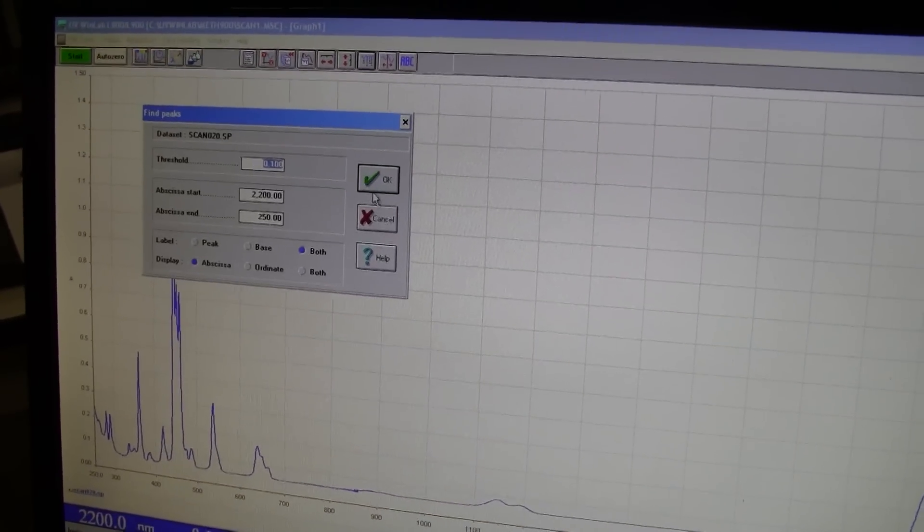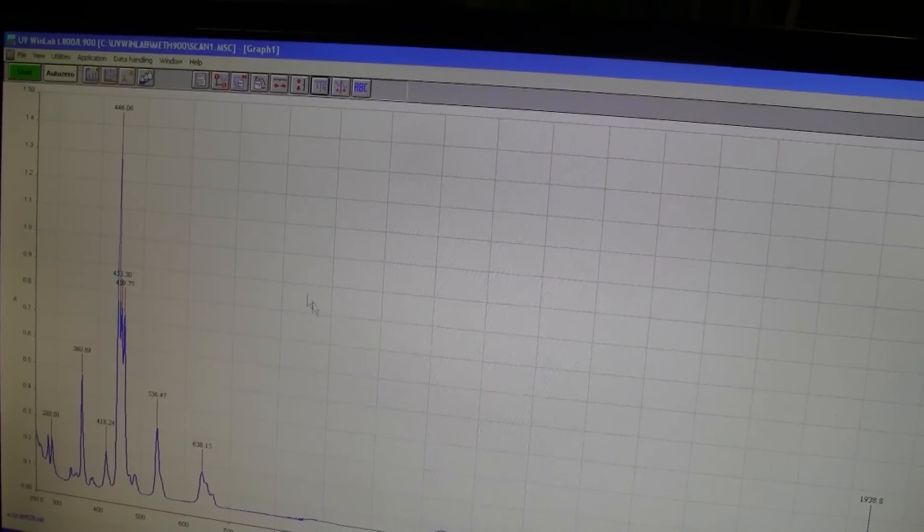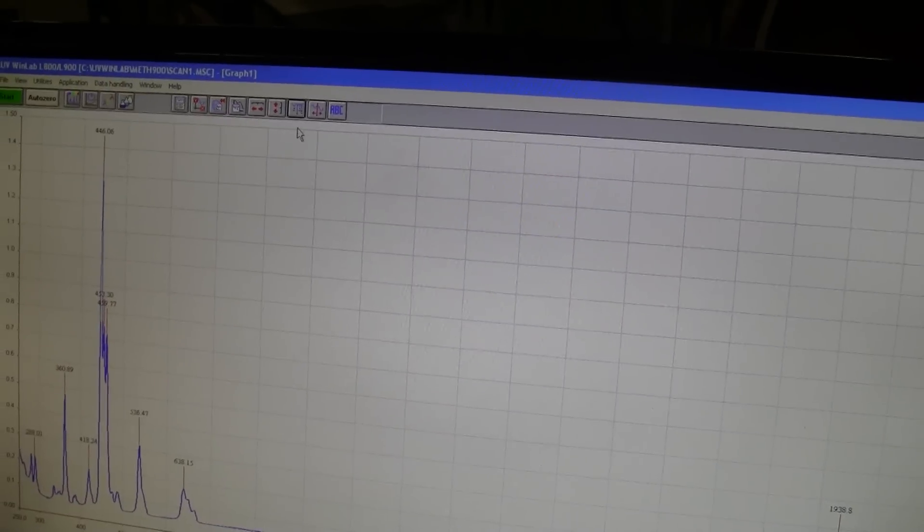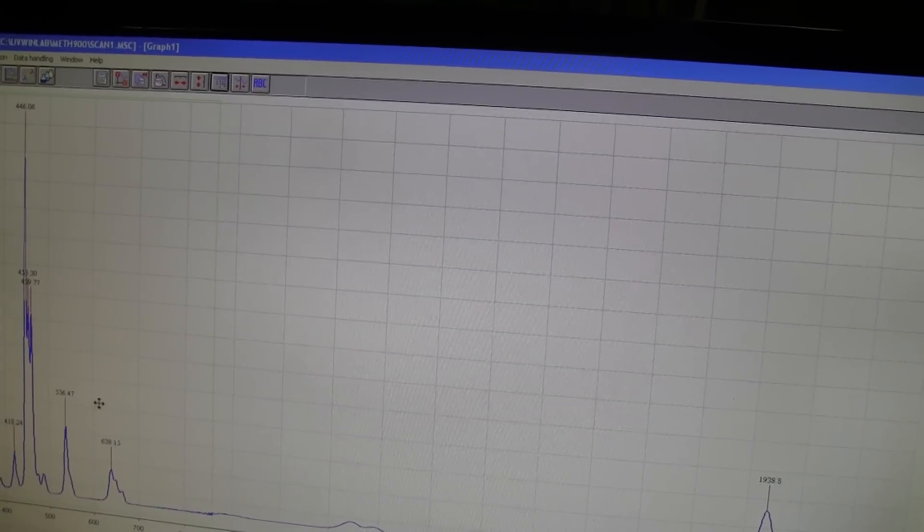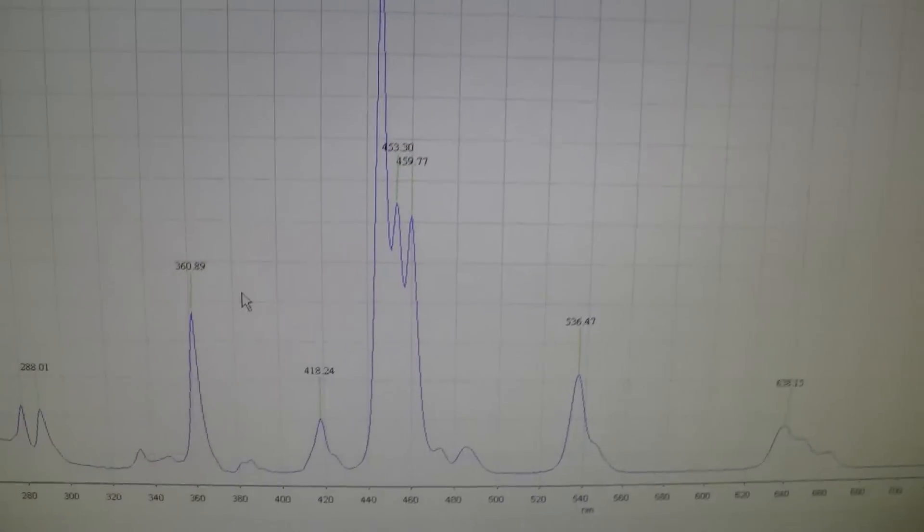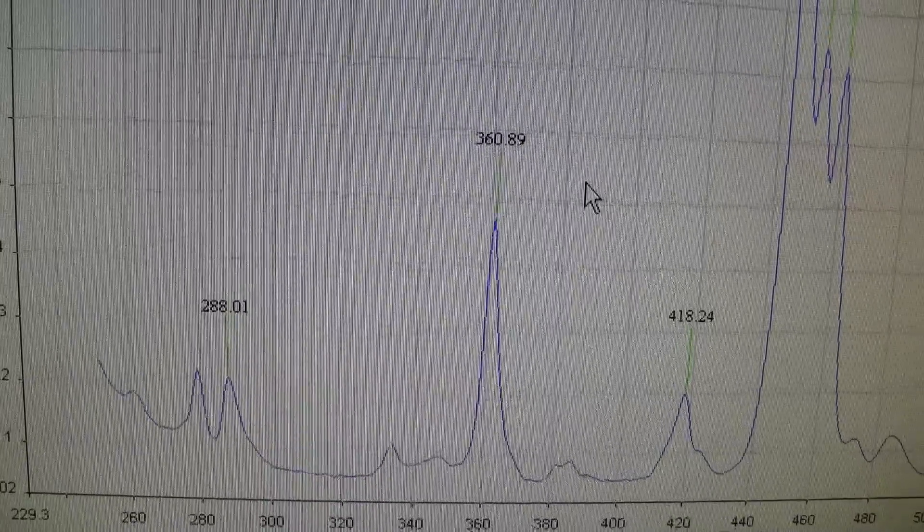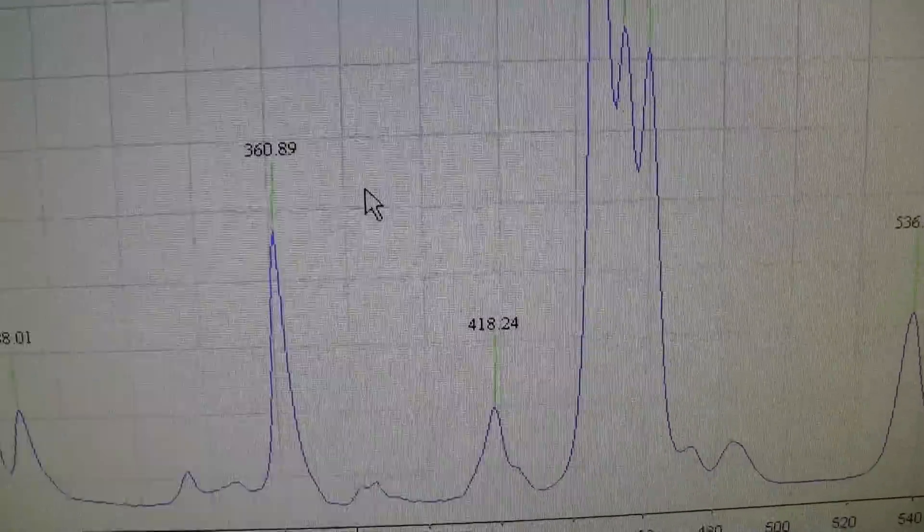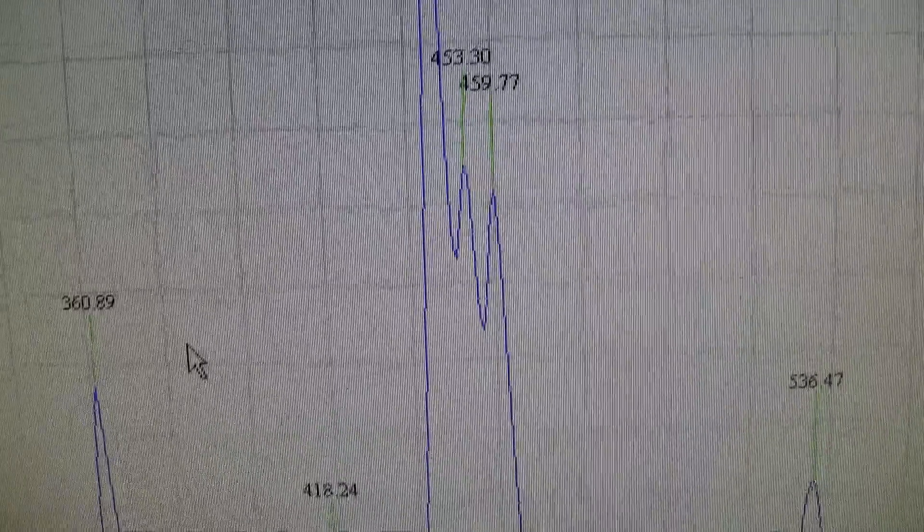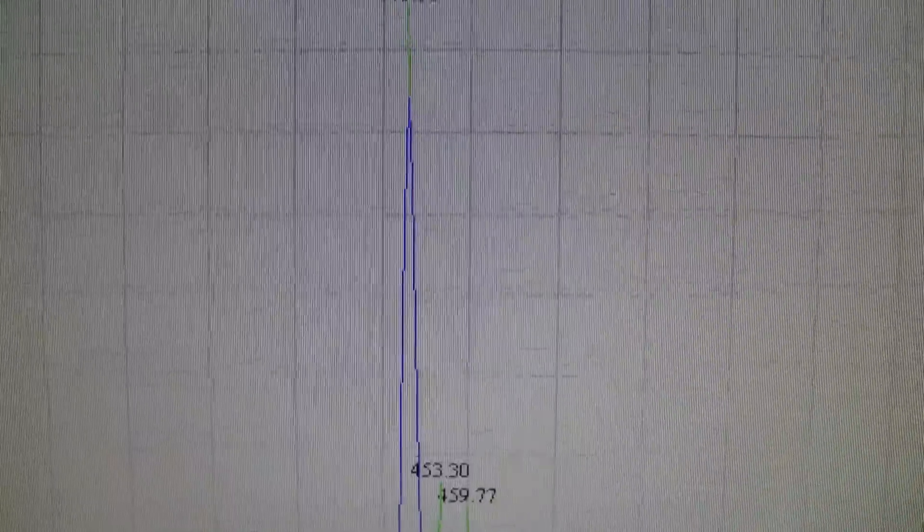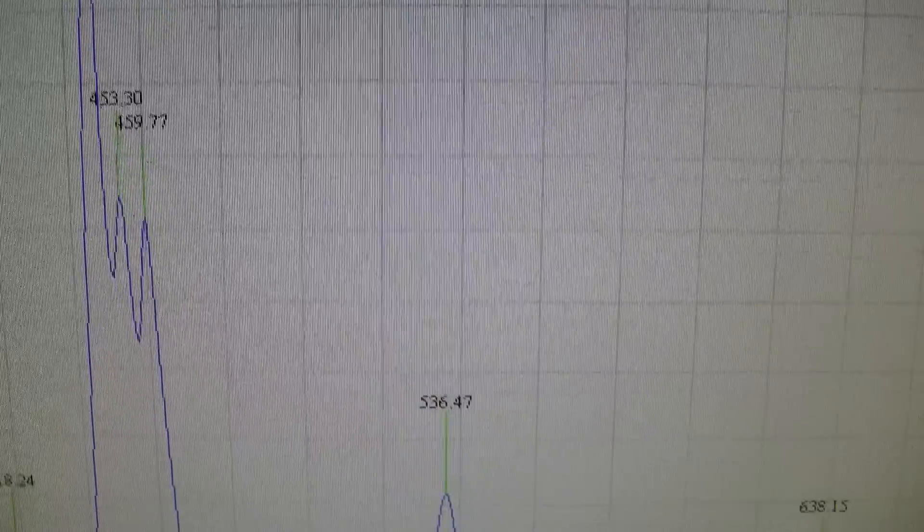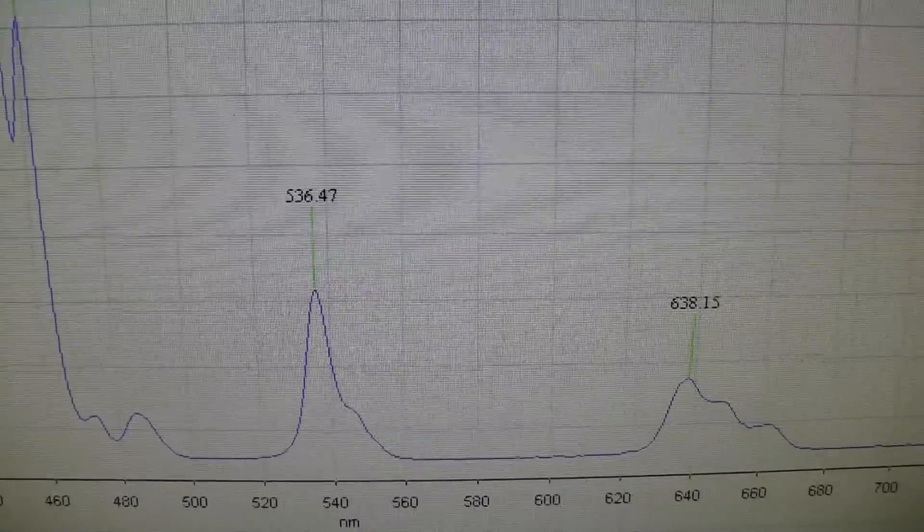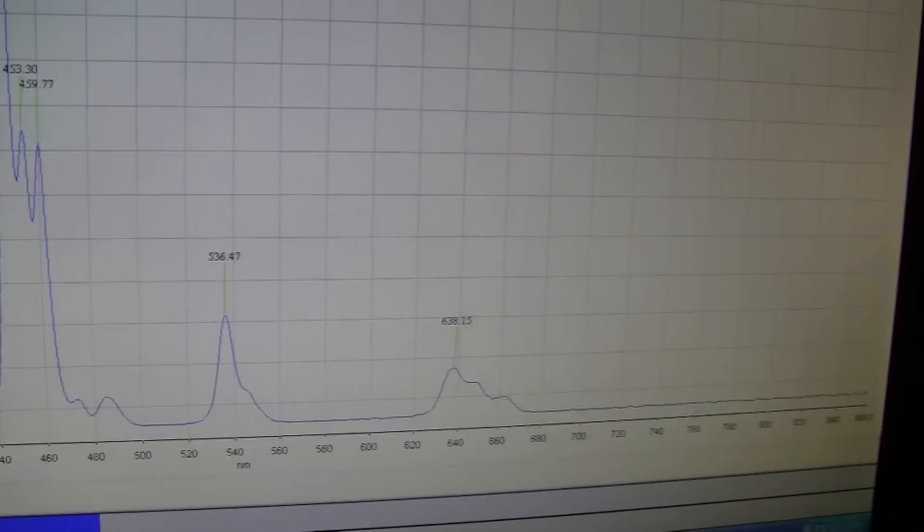Let's grab some peak values. Let's get it right in the... Peak values here look to be right on the button. Excellent. Okay.